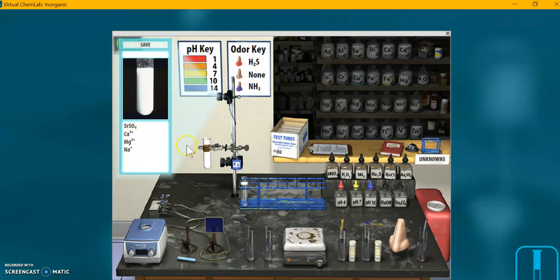And there we go. We've proved strontium. So again, I'm going to remove the precipitate. Just click there. It spins it down, as you can see.